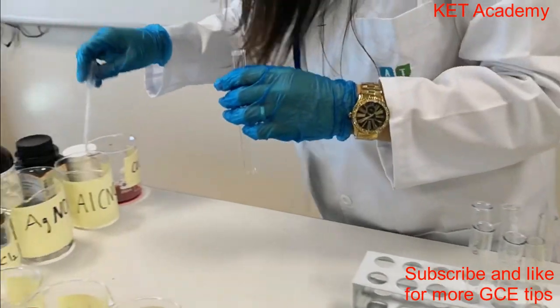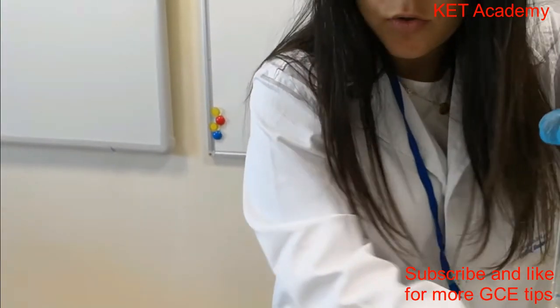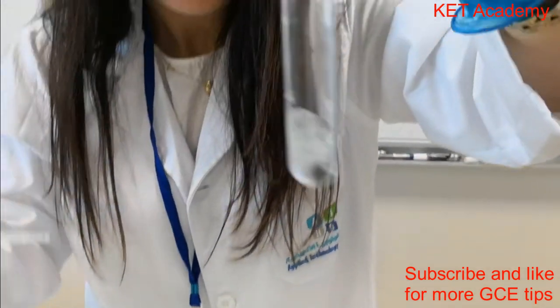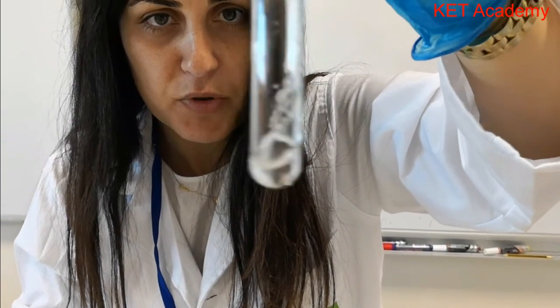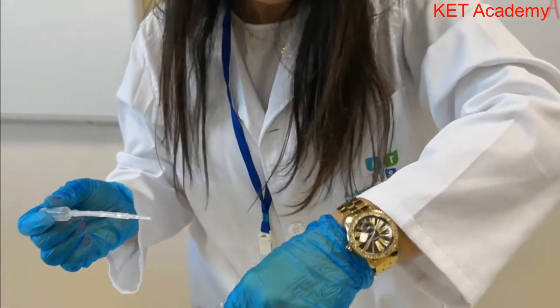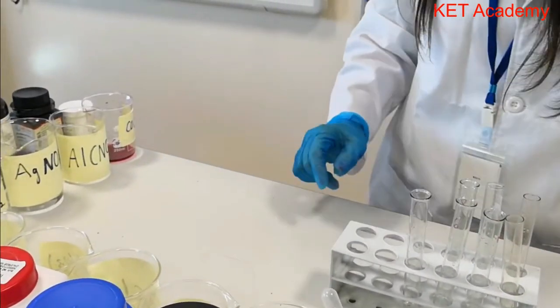Okay, now the aluminium. This is aluminium solution with the sodium hydroxide. It's a white precipitate, but if I put excess sodium hydroxide, it redissolves again. So we're going to put it with the white precipitates if we're adding drops, and then we'll differentiate it from the others by adding excess sodium hydroxide.